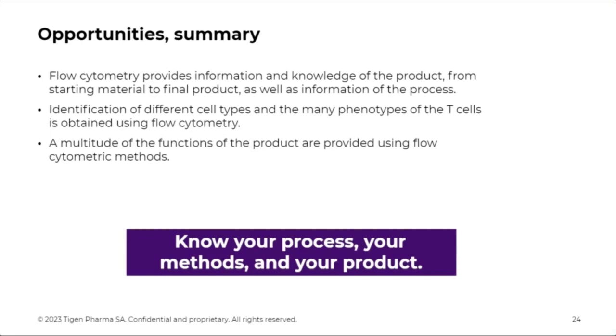My last advice that I have learned over the years is that in order for successful submissions, you need to know your process, you need to know your methods, and you need to know your product. If you know this, you are very good off.